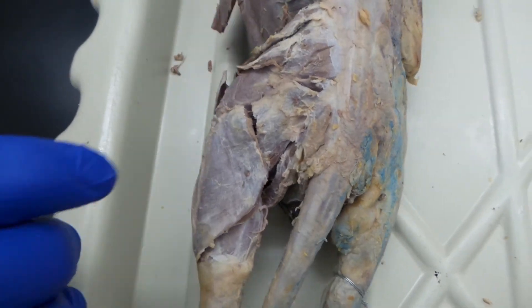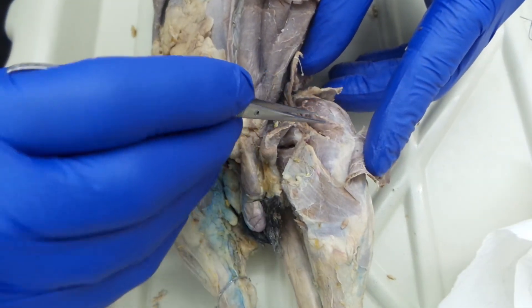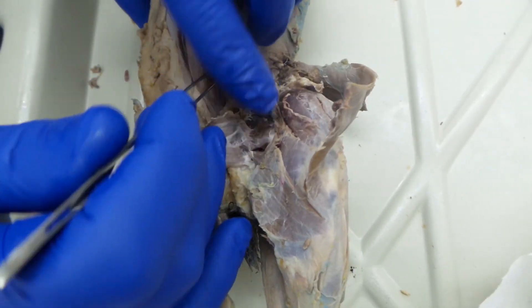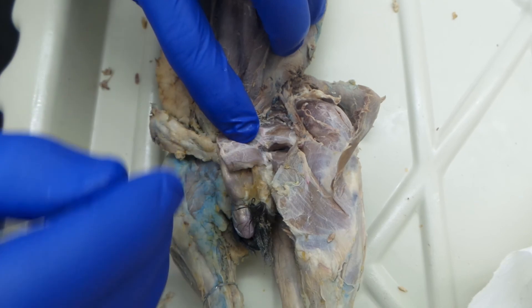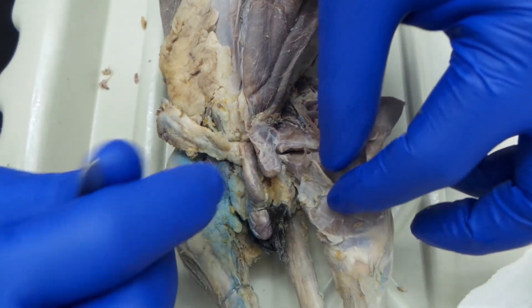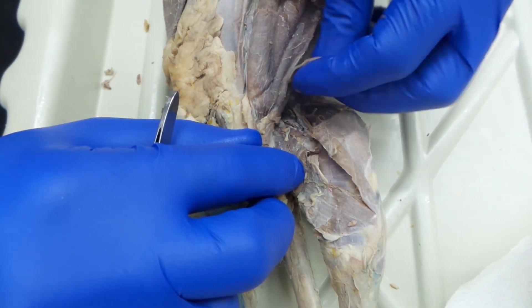Rectus femoris, vastus medialis, iliopsoas, pectineus, adductor longus, adductor femoris, semimembranosus, semitendinosus, and finally gracilis. That's it.